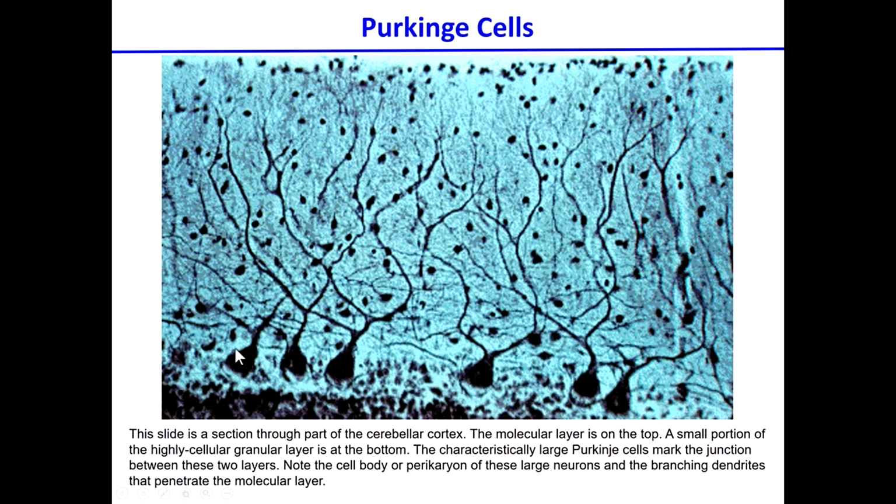This pear-like structure of the neuronal body and the huge ramifications that come out of the body of the Purkinje cells. They're larger than many other cells, and they definitely define the structure in which they are located. Any questions?